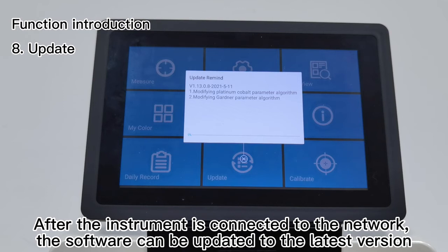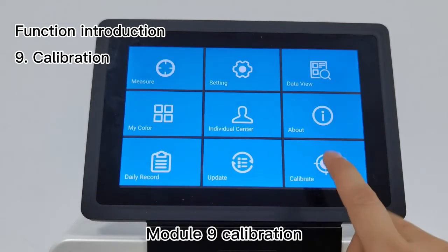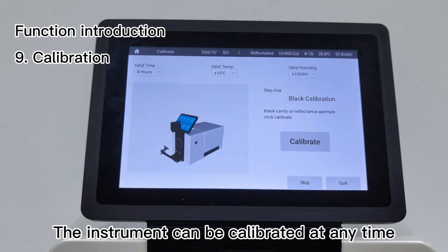Module 8 - Update: After the instrument is connected to the network, the software can be updated to the latest version.